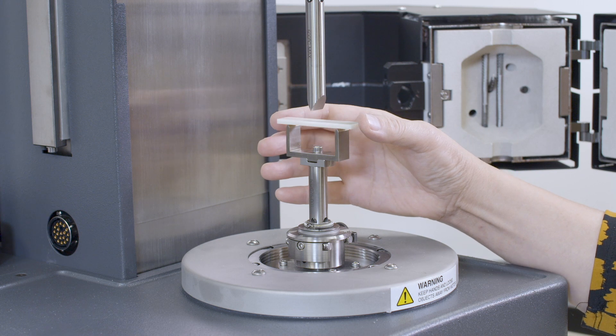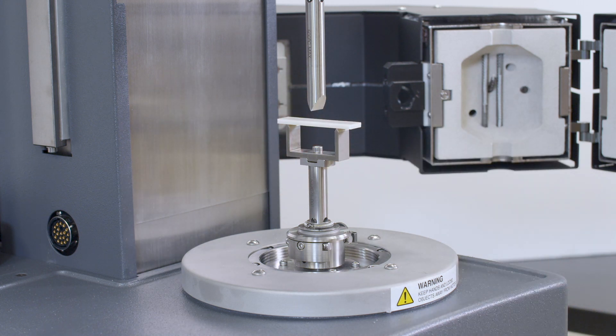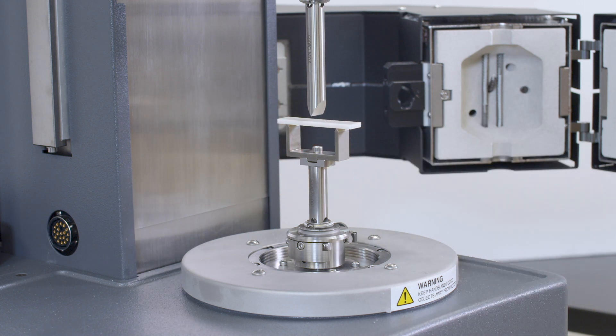Place the sample onto the bottom stage. Lower the upper clamp until it is fully in touch with the sample. The three-point bending clamp is now ready for testing.